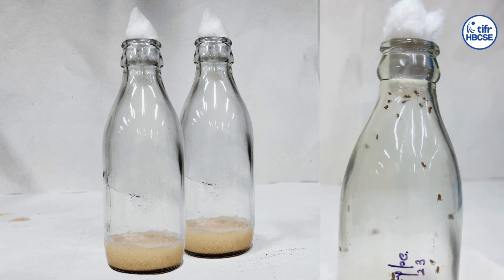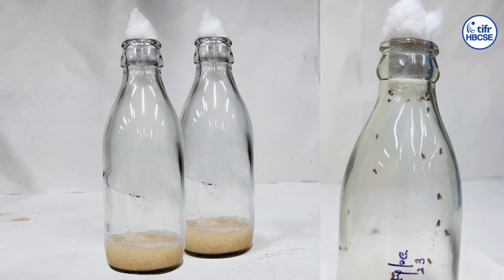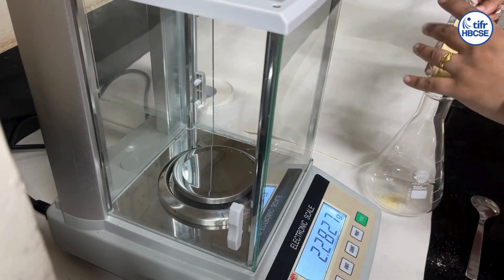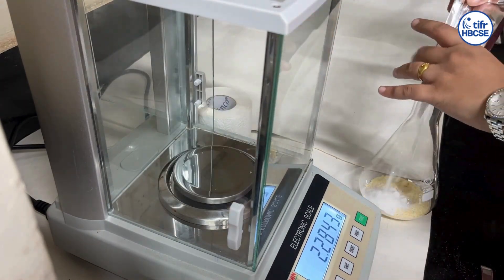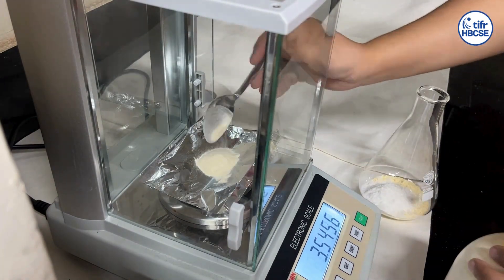For a healthy fly stock, the flies should be transferred to fresh media bottles every alternate week. We use cornmeal agar as the food medium for maintaining Drosophila melanogaster in our lab. Weigh corn flour, dextrose, sucrose, yeast extract, and agar and add them to a 500 ml conical flask.